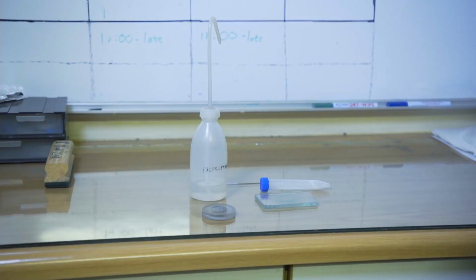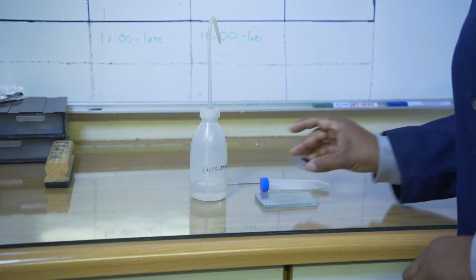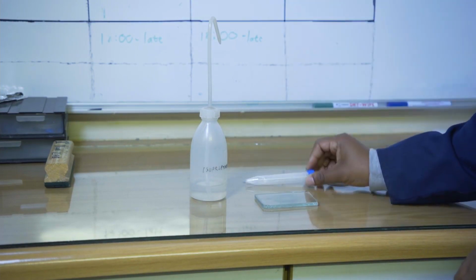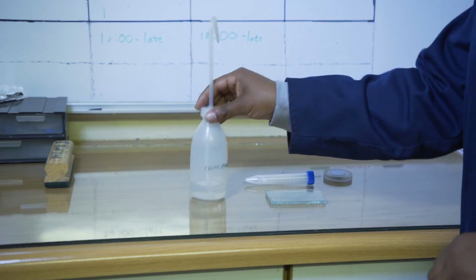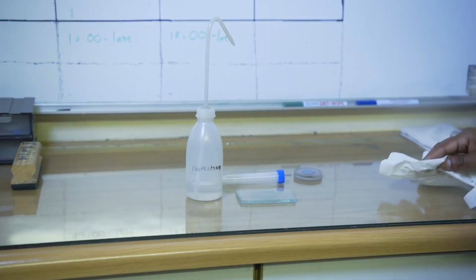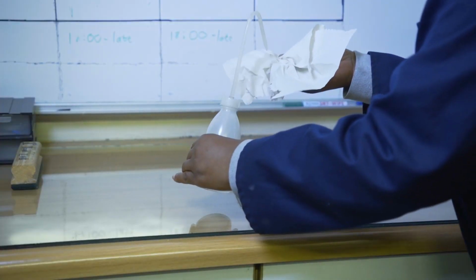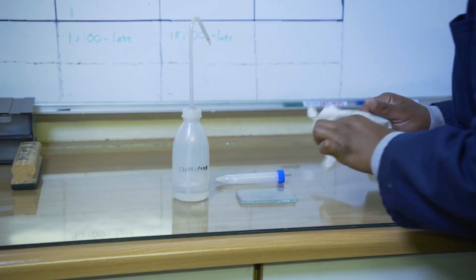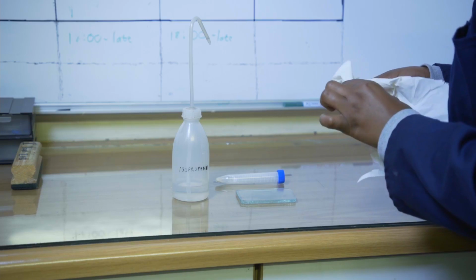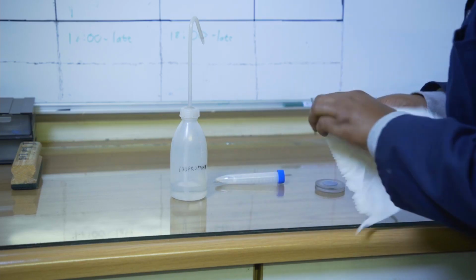For our sample preparation, we're going to need a zero background holder, a spatula, our zinc oxide, glass, and any alcohol, and in this case, we're going to use isopropanol. So firstly, we're going to clean our holder with the alcohol and some paper towel. And we'll clean the glass as well.